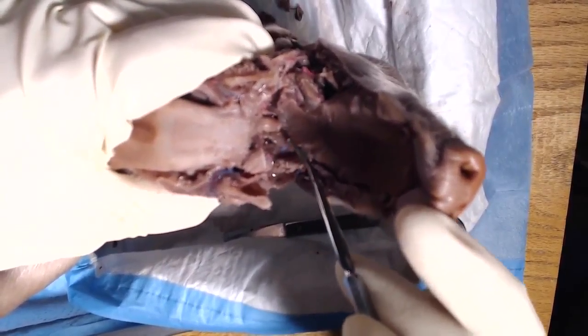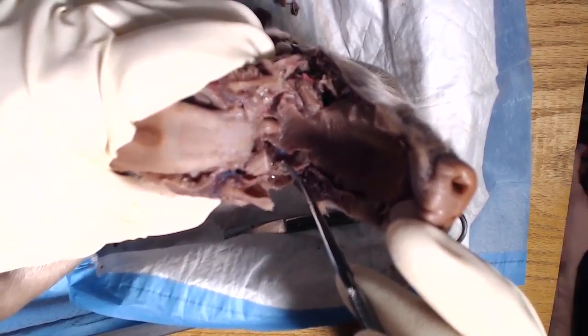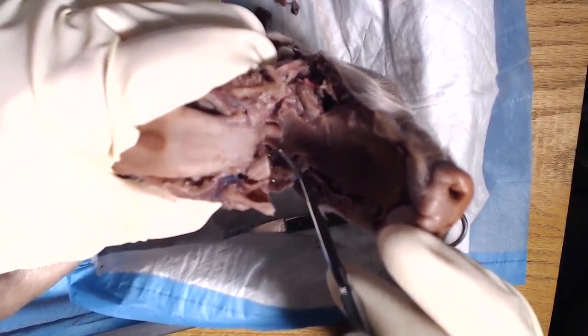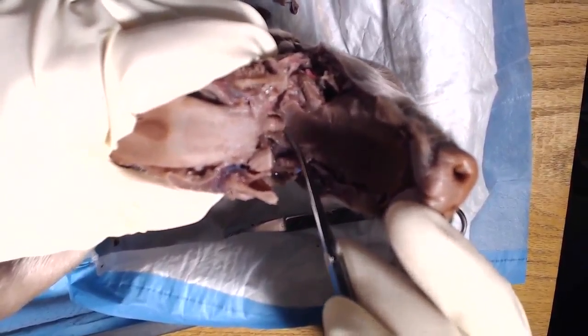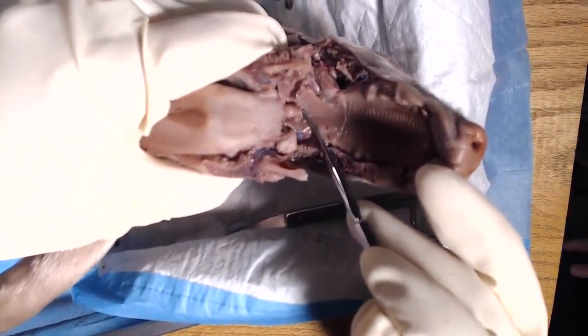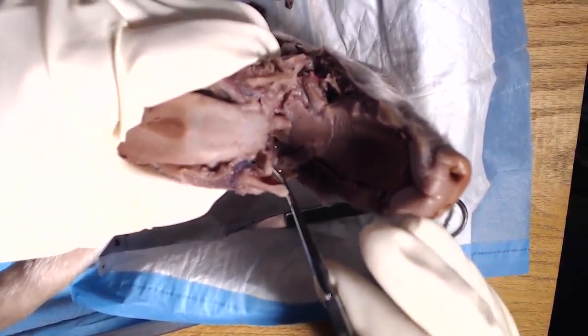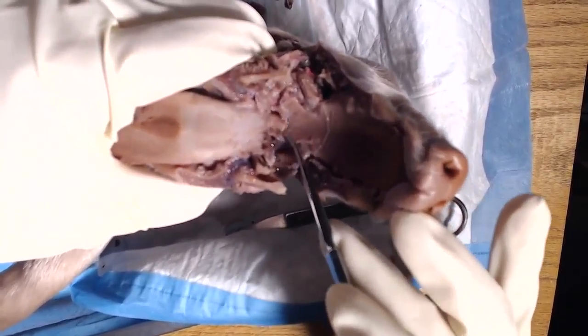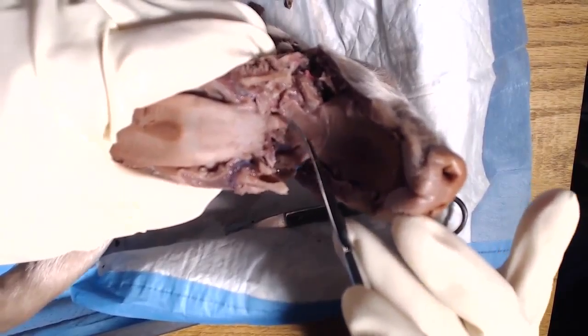Just follow your tongue all the way back. And if you don't see it, you may not have opened up the mouth enough. You may need to make a deeper cut on both sides of the mouth to really pull the jaw down and get that epiglottis to pop out. It's right here. It's just kind of fleshy colored. Really flexible little flap here.